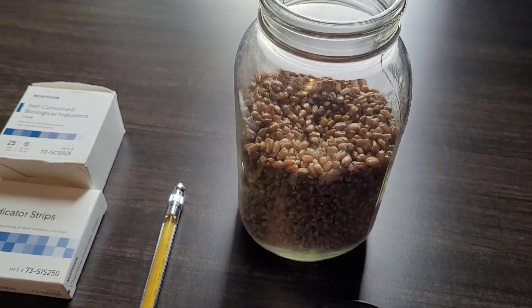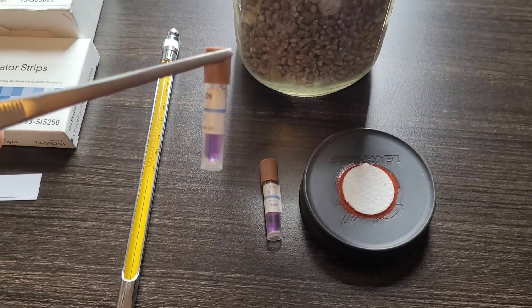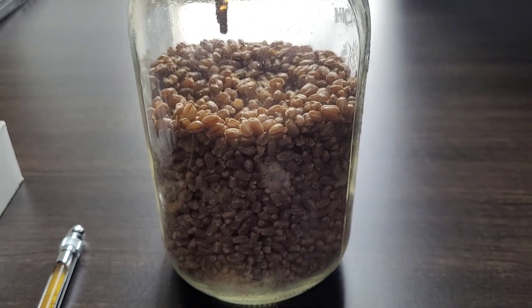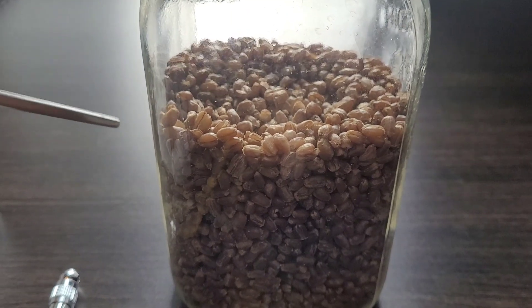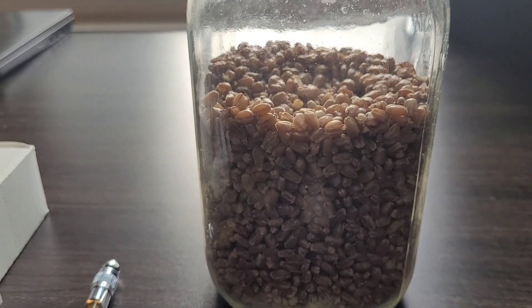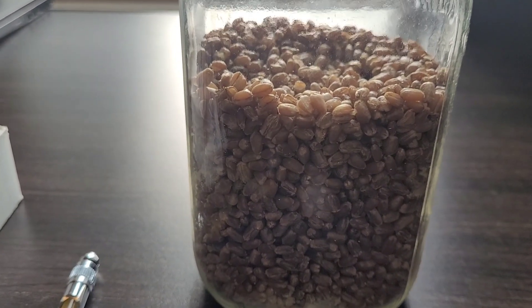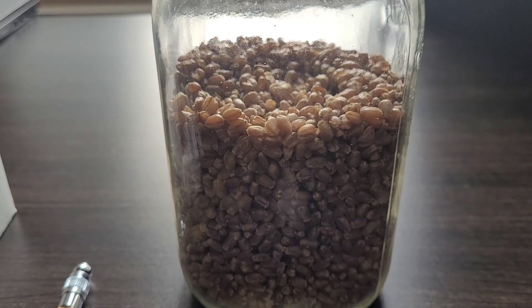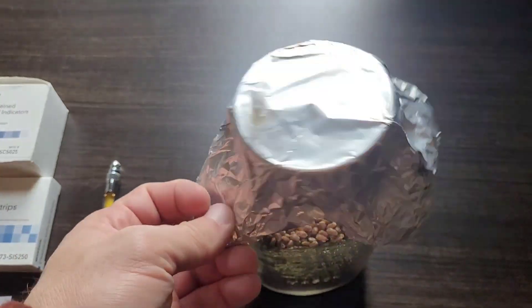This is one quart filled with roughly three cups of hydrated wheat. I'm going to need two biological indicators for this — one is going to be buried centrally in the load. Central placement is used because all of this grain acts as an insulator, making the core of the load the most difficult to sterilize. Core temps need to be reached to ensure complete sterilization of the entire mass of the media, so you're essentially testing the penetration capability of your sterilizing unit. Once the ampule is loaded, put your lid and foil cap on.